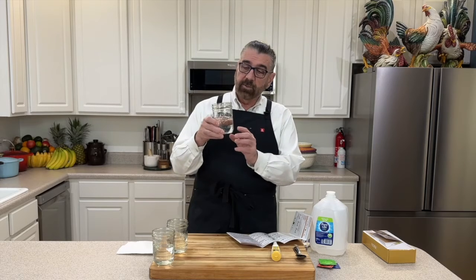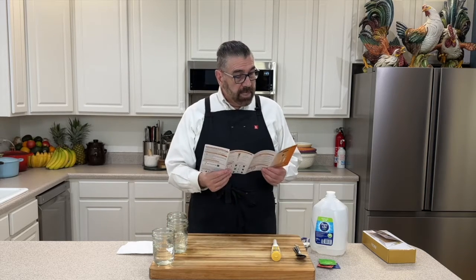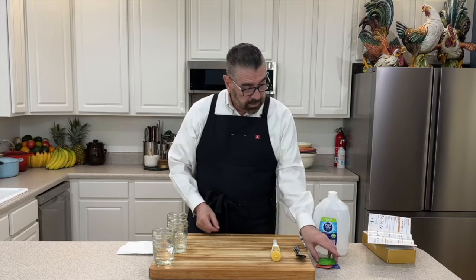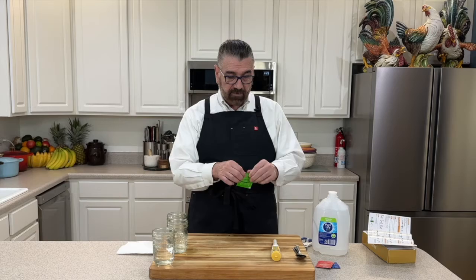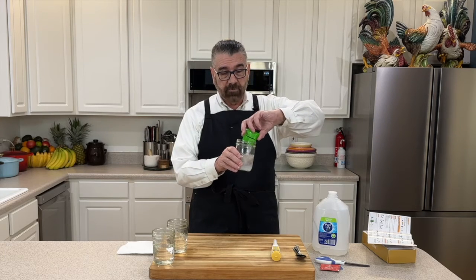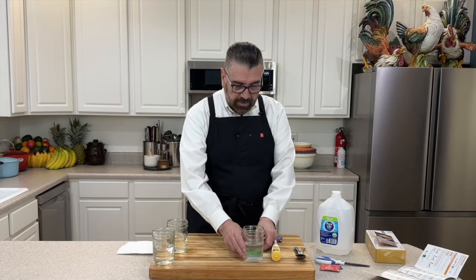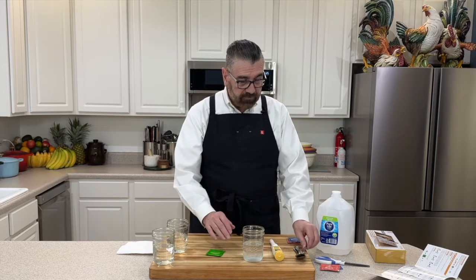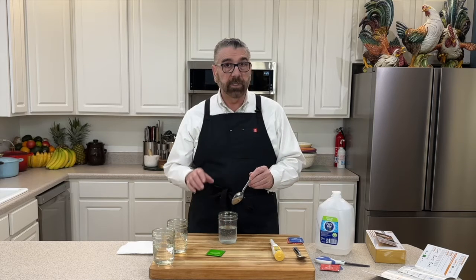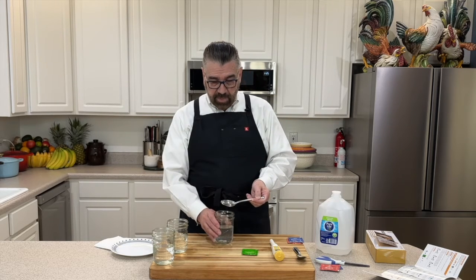I've got my distilled water measured to 250ml in three pint jars. Starting with the 7.0 buffer, which is the green packet — I shake it so the powder falls to the bottom, cut the top off with scissors, and pour the contents into my jar. I mix it with a spoon. Make sure to use separate spoons or wash between jars so you don't cross-contaminate the different buffer solutions.